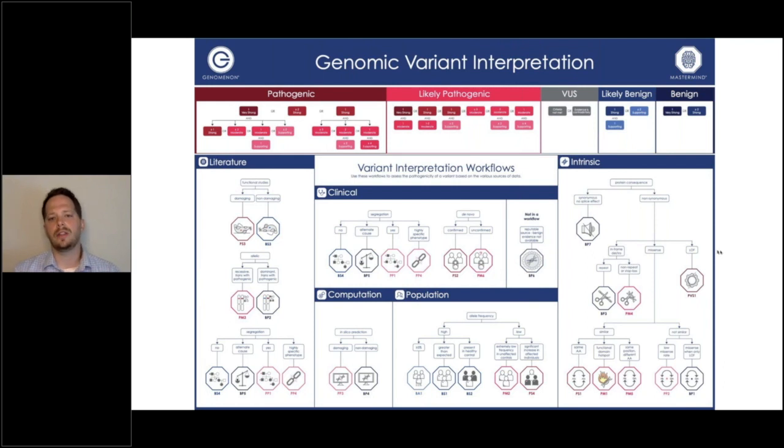And he's going to talk about the other way that we enable our users, whether through partnerships with tertiary software providers or internal to their own homebrewed data processing infrastructure. Mastermind provides API data to fully automate and enhance the efficiency of large-scale, high-throughput clinical workflows.